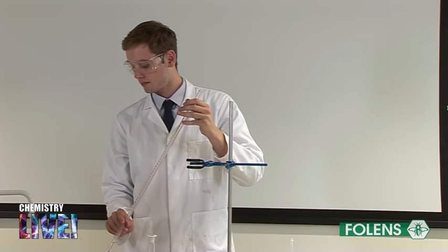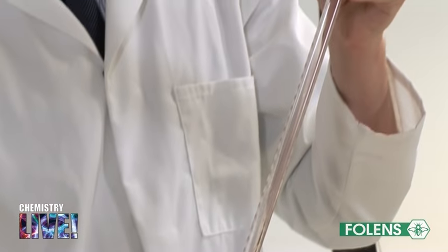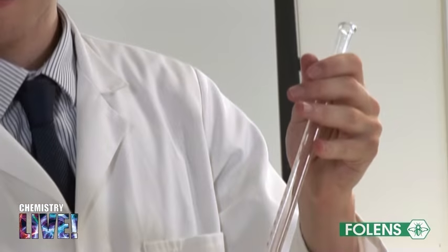In acid-base titrations, the acid is usually placed in the burette and the base in the conical flask. One of the main reasons for this is because some common bases, for example sodium hydroxide, if placed in a burette would cause the tap to stick.